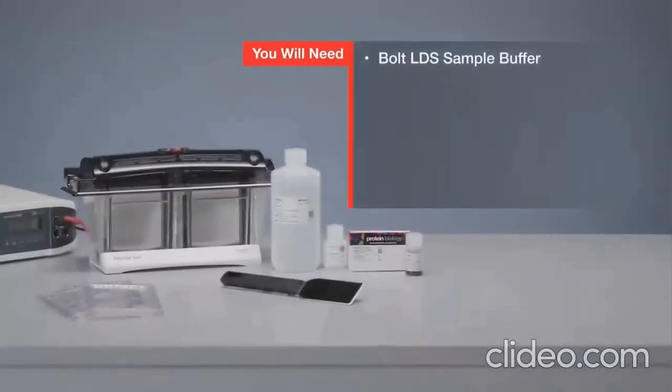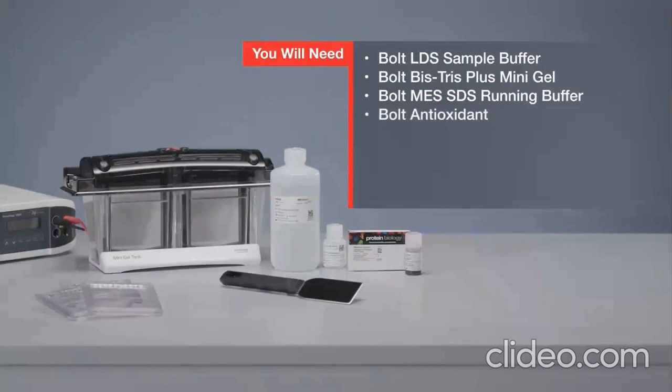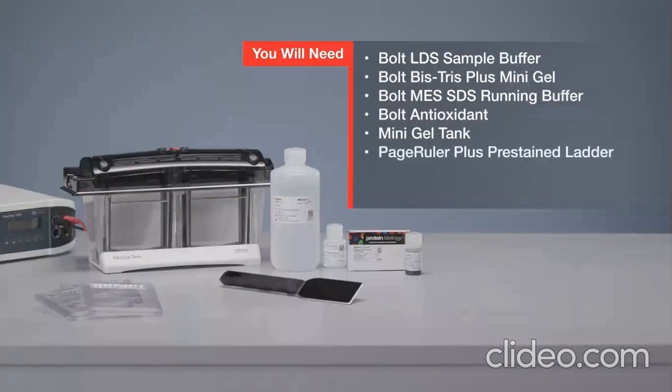To replicate what you see in this video, you will need Bolt LDS sample buffer, a Bolt mini gel, Bolt MES SDS running buffer, Bolt antioxidant, a mini gel tank, a PageRuler Plus pre-stained ladder, a PowerEase power supply, and a gel knife.